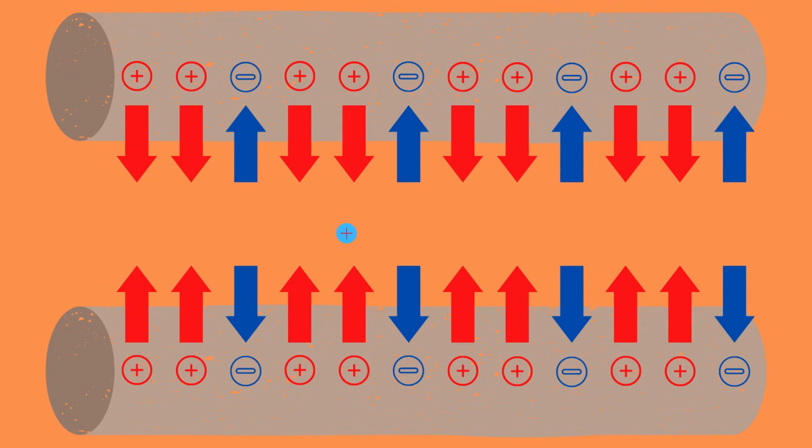For the x direction, smaller ions will stay in phase with the RF drive, gain energy from the field, and oscillate with increasingly large amplitude until they encounter one of the rods and are discharged. Larger ions, on the other hand, will not be affected as much, staying their course without encountering any of the rods. Therefore, the x direction is a high-pass mass filter, i.e., only ions with a high enough mass will be transmitted to the other end of the quadrupole without striking the x electrodes.